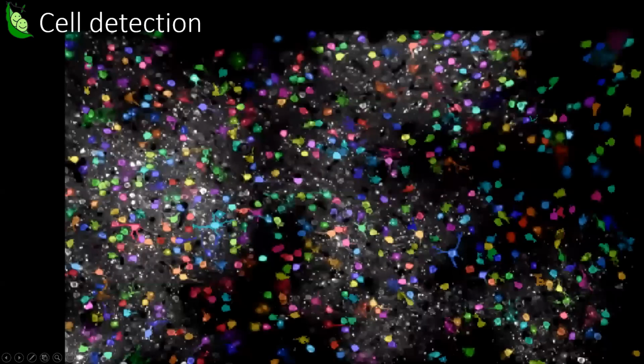All right, and so then you get a picture that looks like this, and you actually find over twice as many cells using an activity-based segmentation such as this, or functional segmentation such as this from suite2p, compared to using an anatomical segmentation algorithm like Cellpose or another algorithm like that.